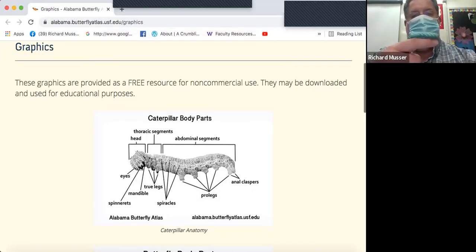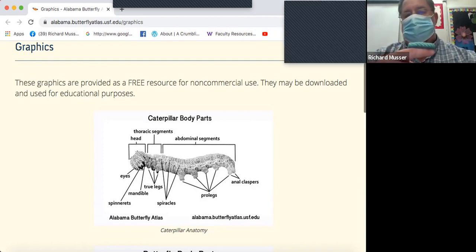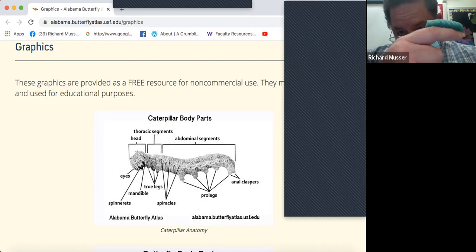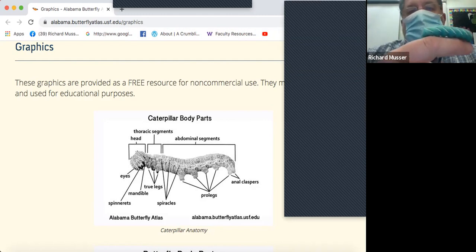Alright, so this is a caterpillar. There's many like it but this one's mine. This is also known as the Manduca sexta or the tobacco hornworm. The reason why they call it a horn is this little projection right here.